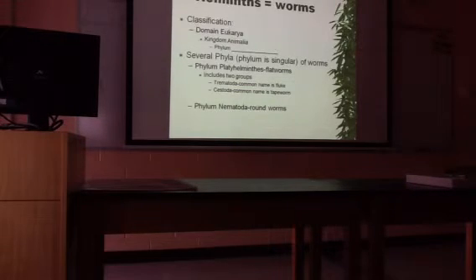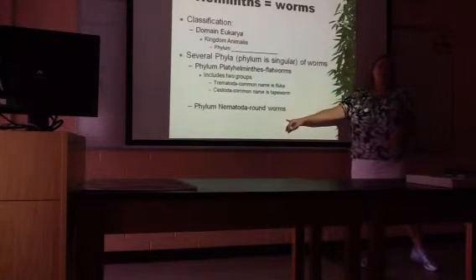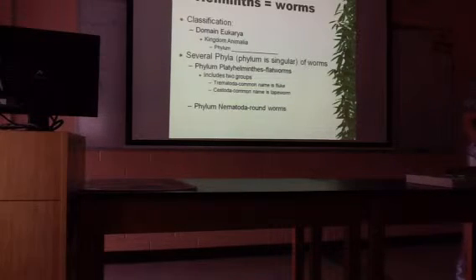If it's not a tapeworm, I look at the body shape, particularly toward the tail. Flattened, it's Trematoda; round, Nematoda, and in general, the round ones are brown. They're not all brown, but most of them are.